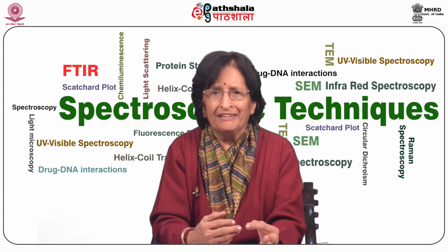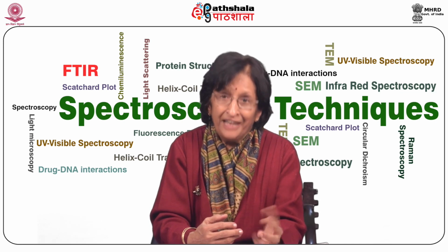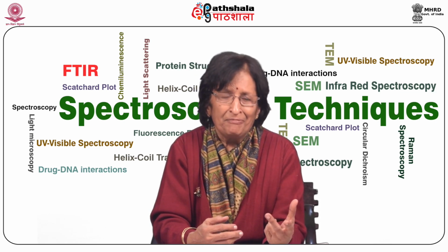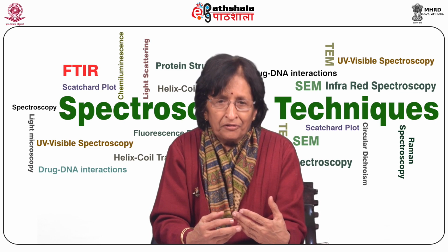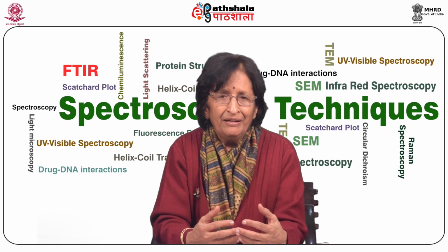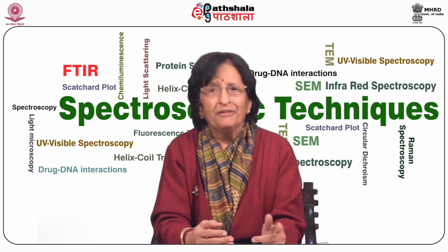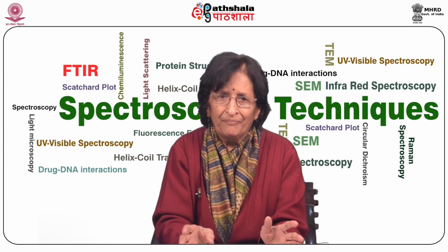The important factor is the sample chamber can be heated and one can do measurements at a particular temperature also. Quality of the wavelength selector is very, very important. If you get a wrong beam or a diffuse beam, you will get a wrong answer. In liquids, the extinction coefficient usually changes slowly with the wavelength. So, the measurements are usually made at a peak to minimize the error.